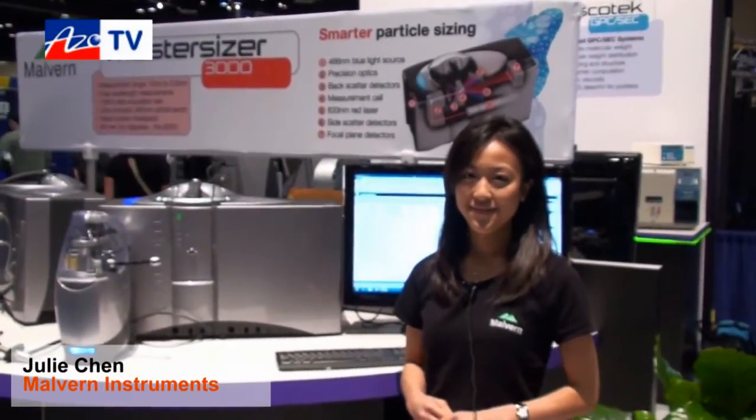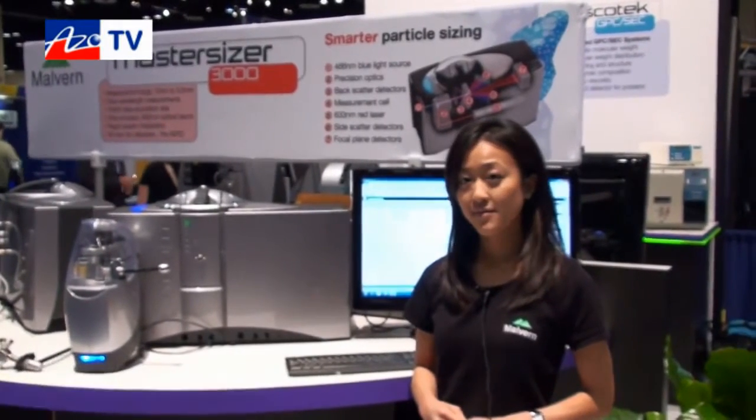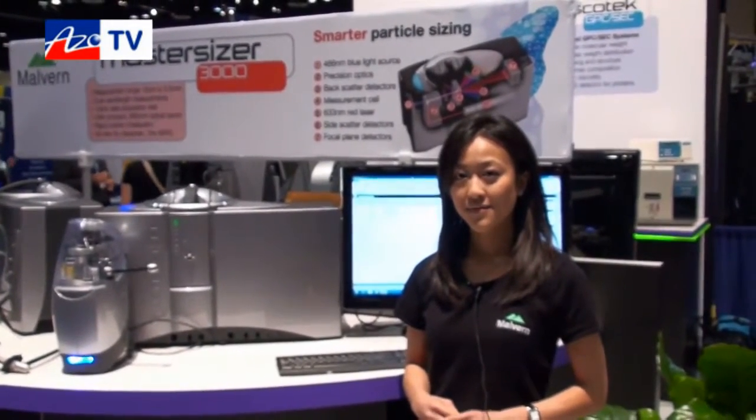This is Cameron Chai from azom.com, bringing you an episode of AzoTV. Today we're speaking to Julie Chen from Malvern Instruments, and she's going to tell us about their MasterSizer 3000 particle size analyzer.